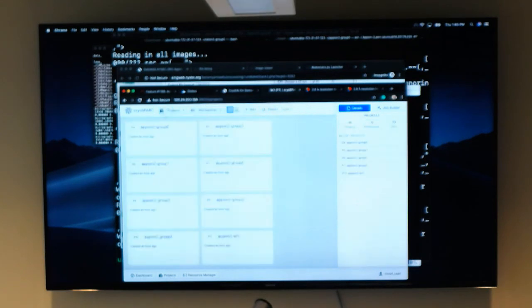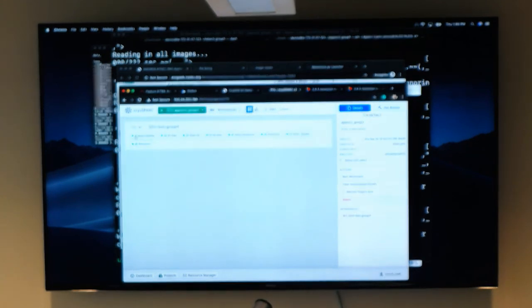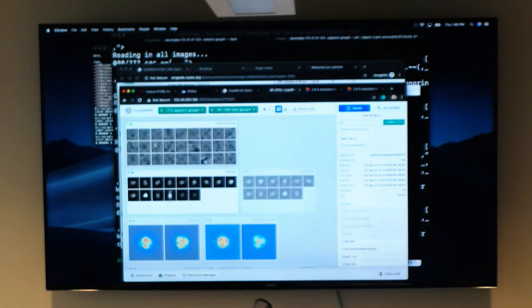Okay, it's about a good time. Does anyone have a project they want to volunteer? We could just go over some results and see where everyone's at. Anyone want to volunteer? Yell out a group. Group 4. Okay, group 4, let's go. Let's see if I can interpret that.